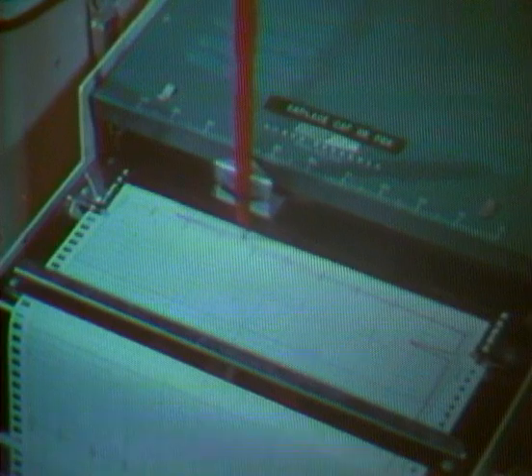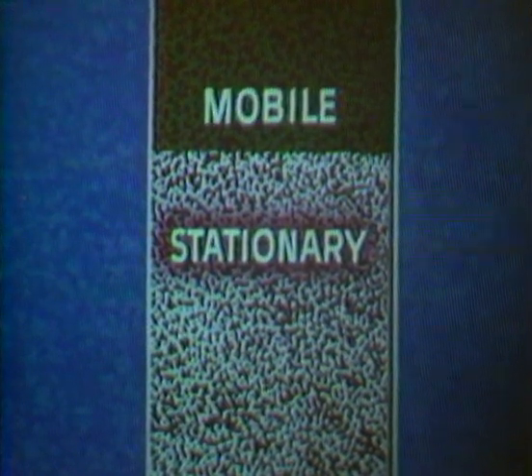Chromatography is a physical method of separation. It is based on the distribution of the components of a sample mixture between two phases. One phase is stationary, the other mobile. It percolates through the interstices or over the surface of the fixed stationary phase. The components of the sample are carried by the mobile phase.